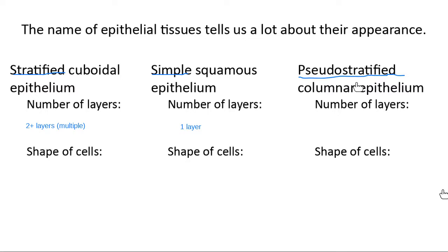And then here's my personal favorite. We got pseudo stratified over here. Yeah, Kaylin's absolutely right. Pseudo stratified. These are my fakers. I can't remember if I specifically said this last week, but I always love to say with pseudo stratified, these are the fake it till you make it types. So they only have one layer of cells. So when we're talking about their layers, they only actually have one layer of cells, but they're trying to make it look like there's more than one. So looks like more than one.